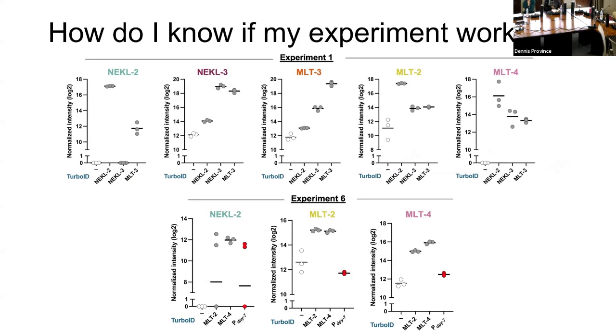So anything that shows up here is an infinite fold change. You can come up with ways to estimate it, but I do agree that in the end, I don't really talk about estimations for the most part. I don't find them useful. It's binary. It's there. It's real. I can believe it.